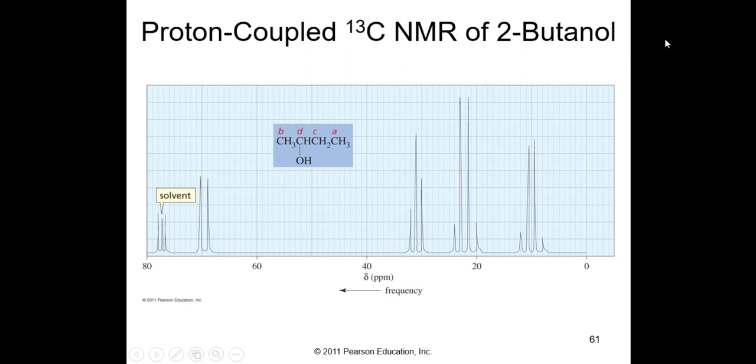Now here's the proton coupled C-13 of 2-butanol. This is valuable. Now you apply your N plus 1 rule to carbon. There's the solvent identified down around 78, due to the deuterated chloroform, a little bit of CHCl3. I'm seeing a quartet, a quartet, a triplet, and a doublet.